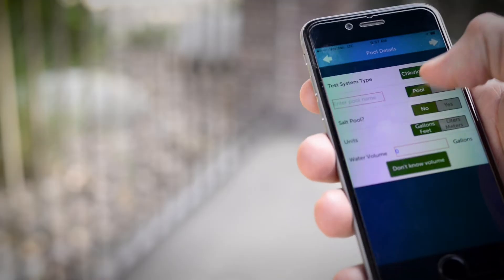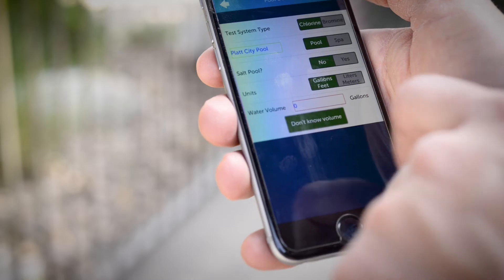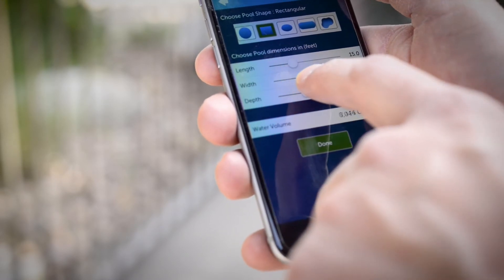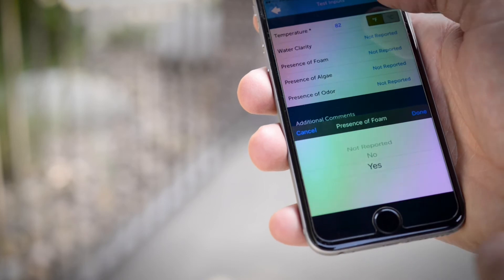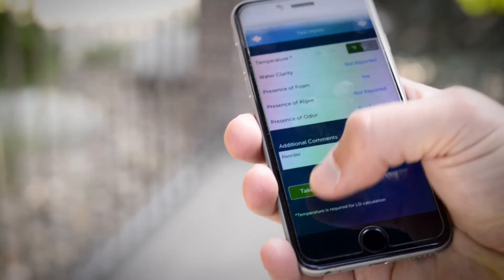Once you've captured key information such as the sanitizer type and volume — and there is a volume calculator in case you need assistance — you can begin to input your results. You also have the option to include water temperature if you want the saturation index value calculated as well, noting any water conditions such as foam or cloudiness. If you want to add a picture of the pool or spa to the test report, you can take a photo.